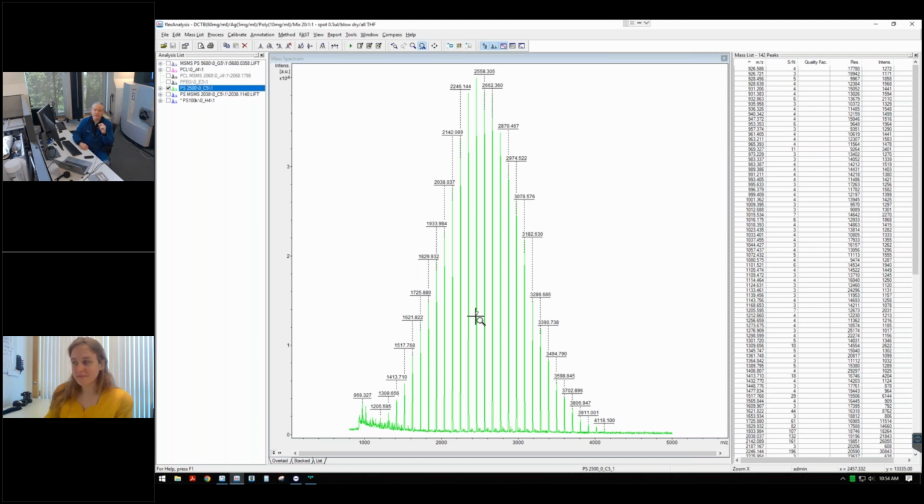And so you could either mix your matrix and possibly a little bit of salt and your powder, your sample, in a centrifuge tube, stir it up, or what I do is just, again, mix it on the target surface, kind of blend it together with a plastic spatula as not to damage the target surface, hopefully get a nice thin layer on the target surface, blow off the excess, and then you can acquire a MALDI spectrum from the thin layer of solid material that you deposited on the target surface. But that works for, again, pitches that I've been analyzing, functionalized waxes, things that don't go into solution very easy. That's solid sample prep.